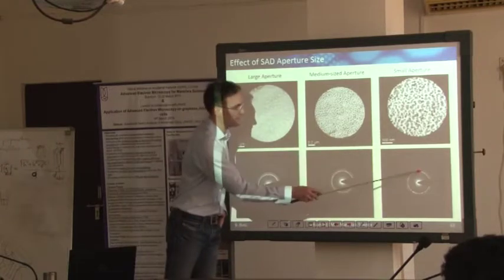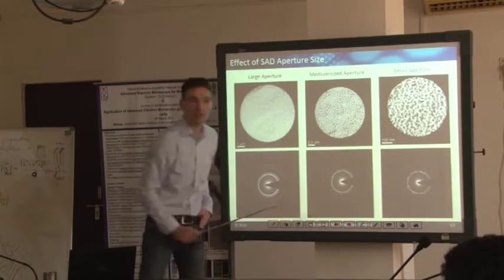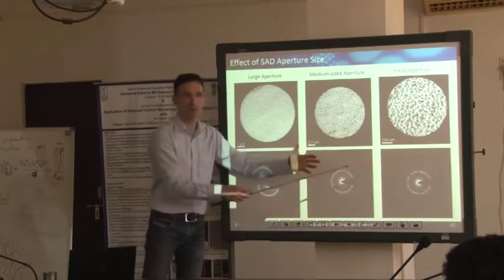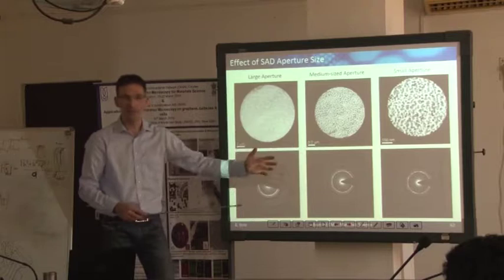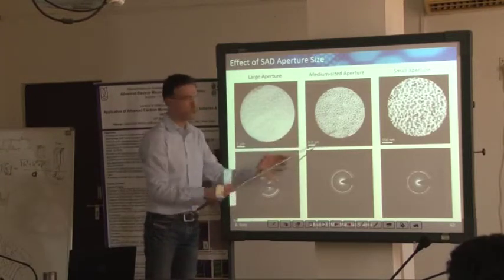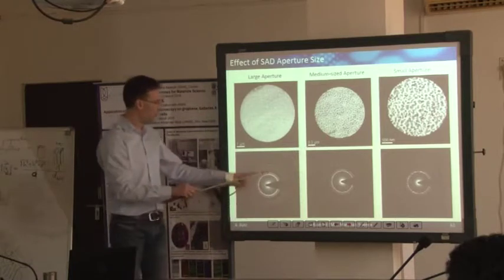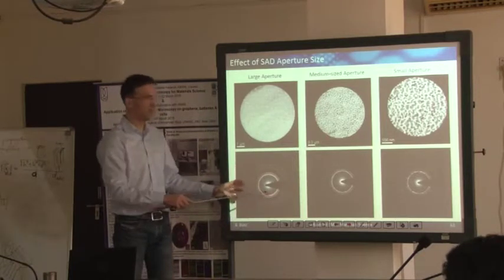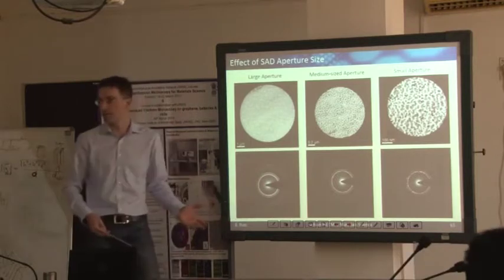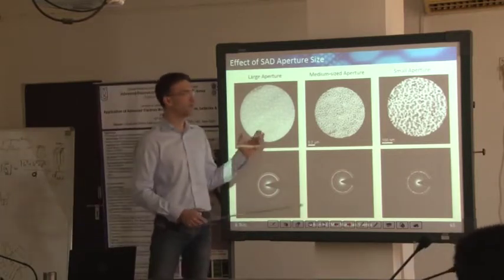In this particular case, you observe individual reflections due to these different grains. As I mentioned, this is just a superposition of all the contributions of the individual grains. The more of these crystallites contribute to the diffraction pattern, the closer those reflections get, until we end up in a homogeneous ring. And there are different ways.